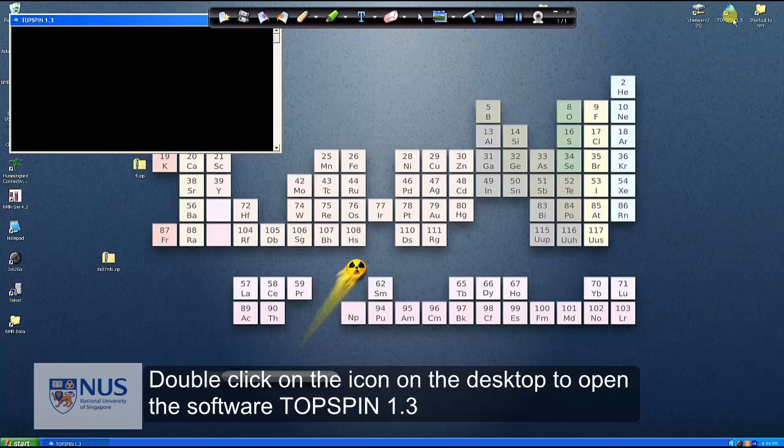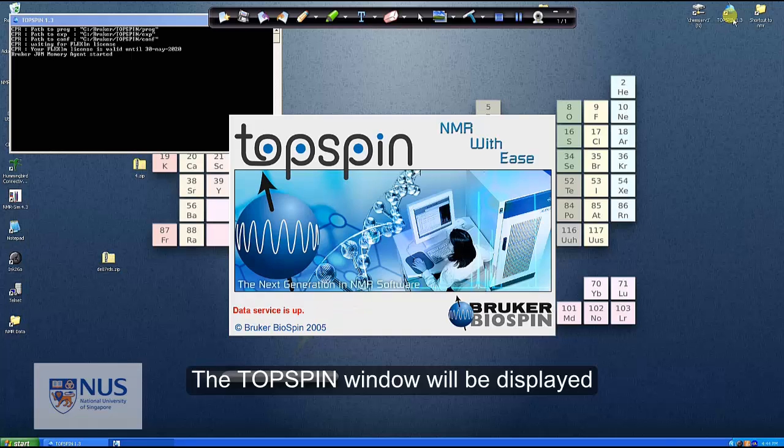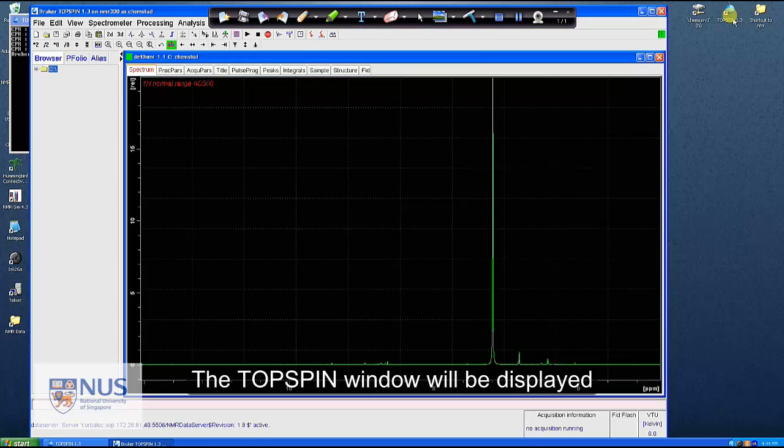Double click on the icon on the desktop to open the software Top Spin 1.3. The Top Spin window will be displayed.